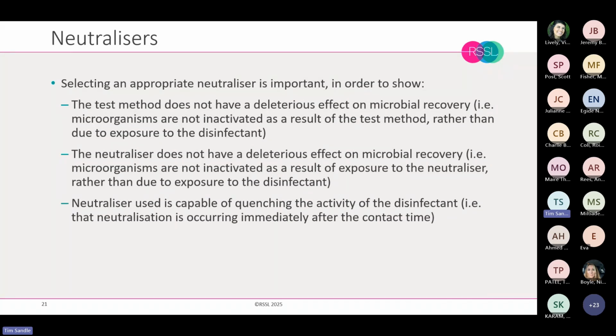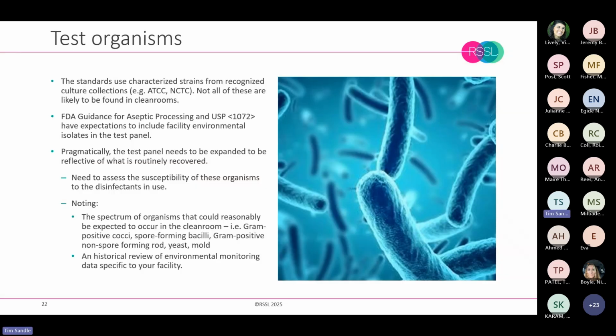So without knowing these two factors, we can't really determine whether the disinfectant is effective or not. So it's an important series of related tests. Another choice that we have to weigh up is with the test microorganisms.